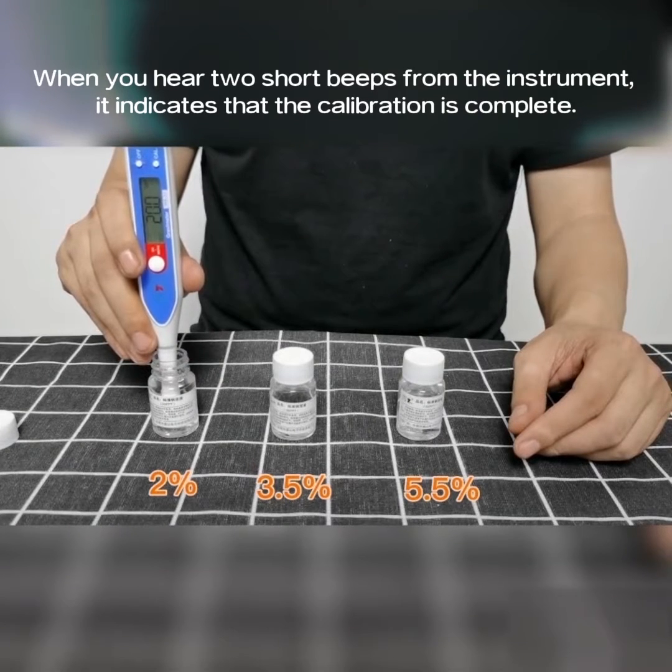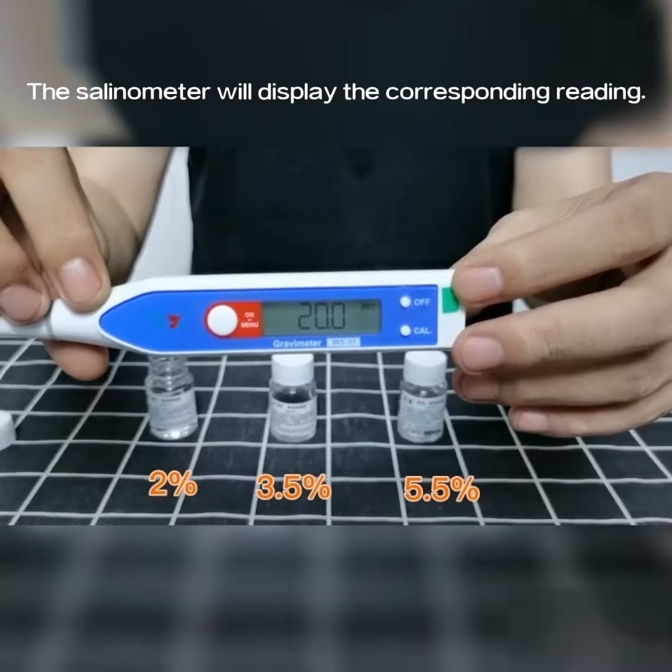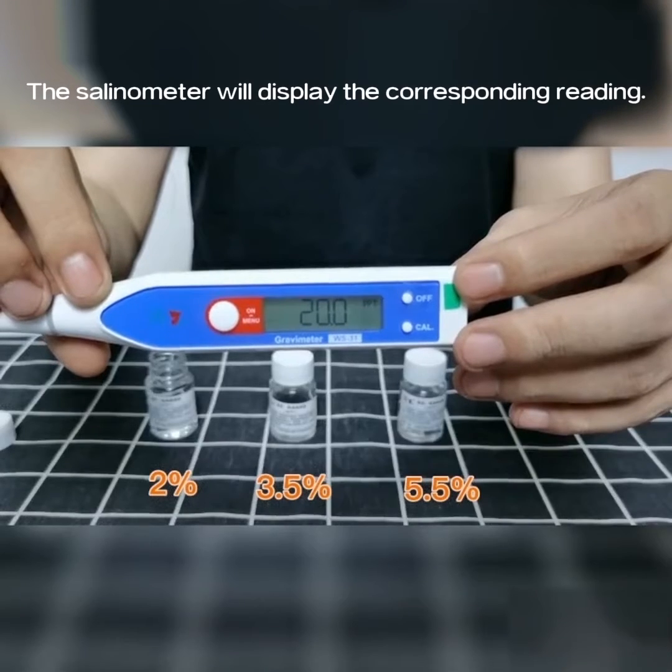When you hear two short beeps from the instrument, it indicates that the calibration is complete. The selenometer will display the corresponding reading.